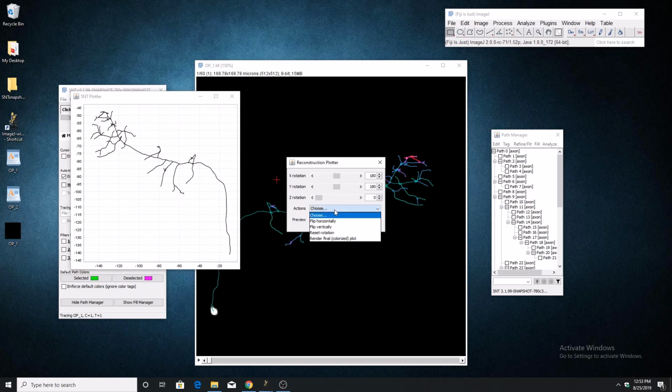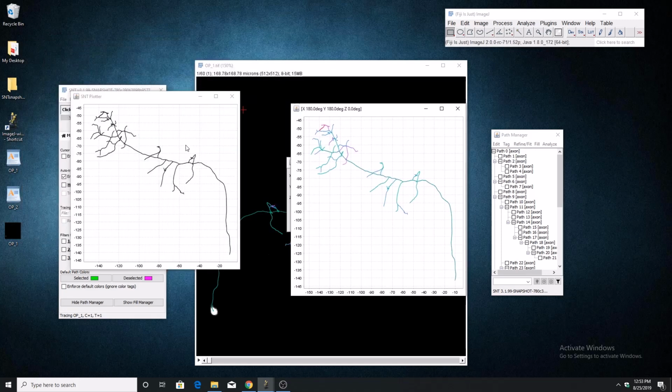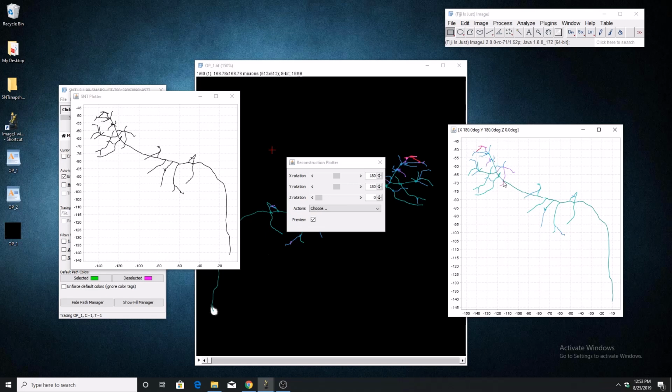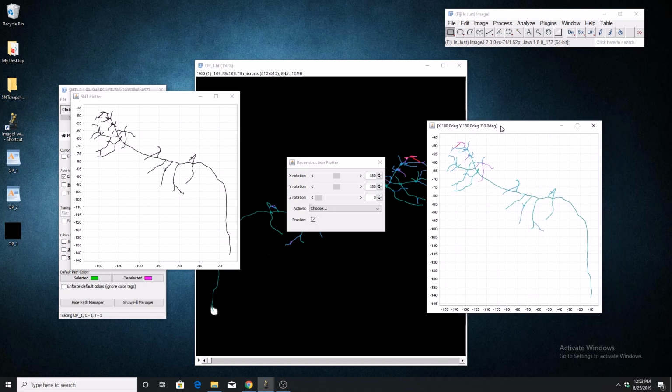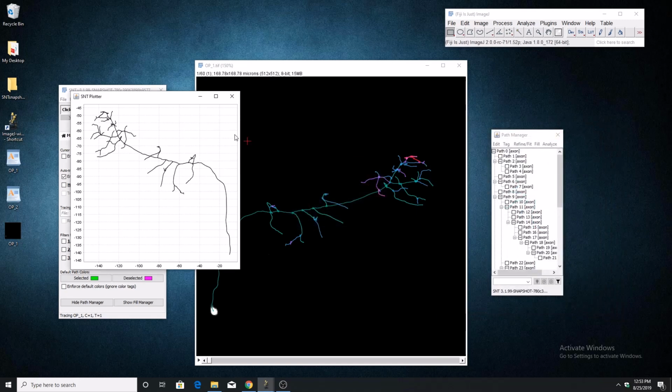And if you go down to Render Final Colorized Plot, it'll generate a colorized version of this plot with the same orientation that we specified, with the color-coded metric that we chose for our reconstruction. And you can save this plot, do whatever you want with it, say make figures for publications, presentations, etc.